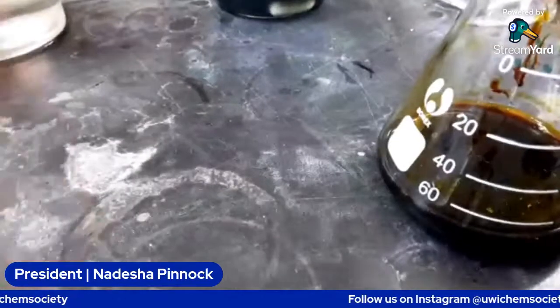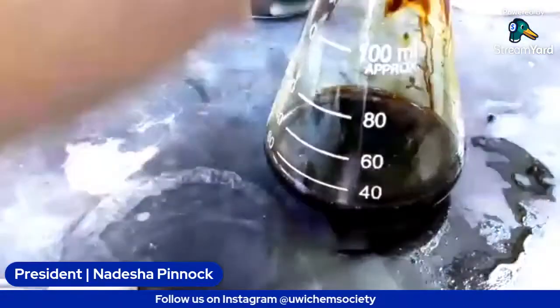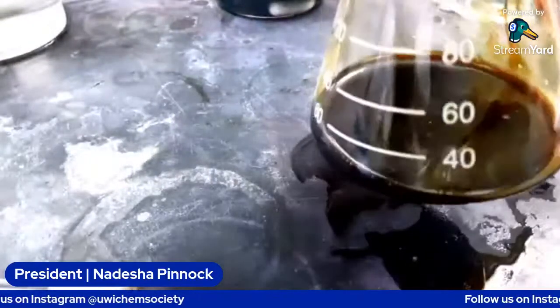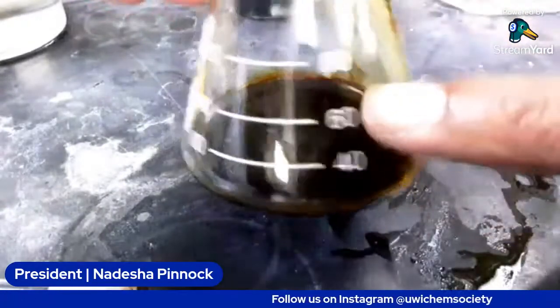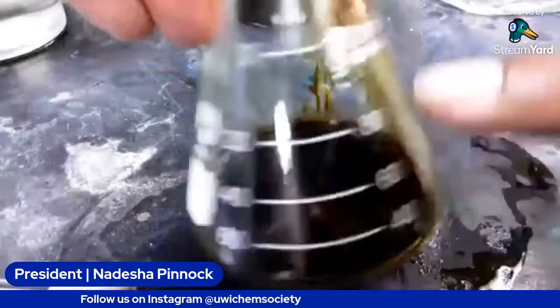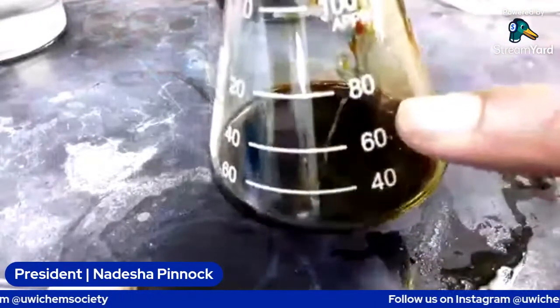So we have a 40 ml mark and a 60 ml mark. Because we're using this side, the side that goes up to 100. You're not using this side, you're using this side. So you have a 40 mark and a 60 mark.